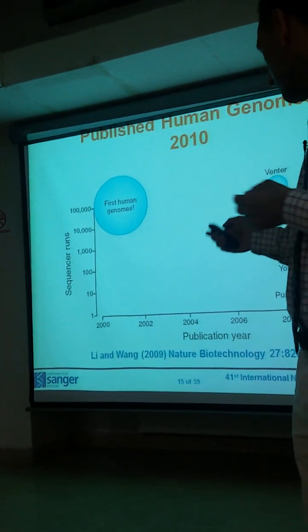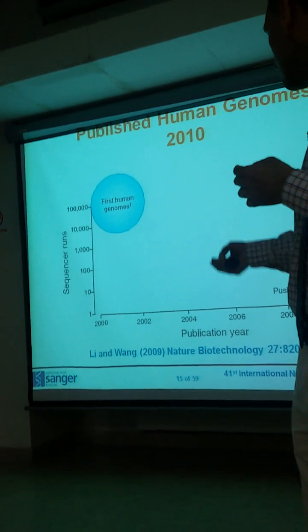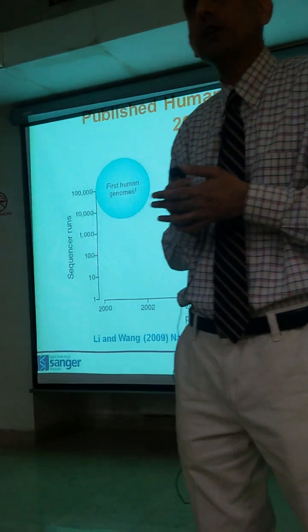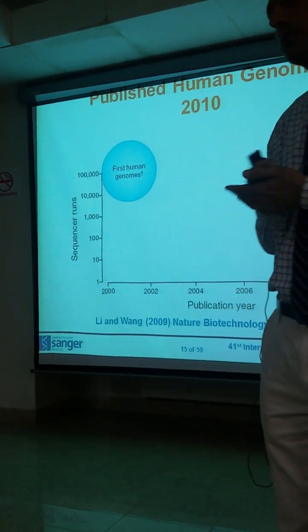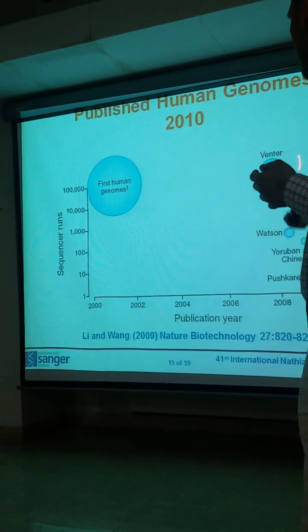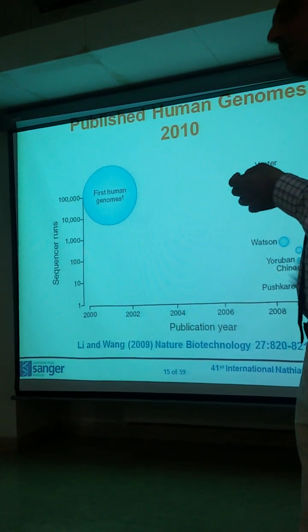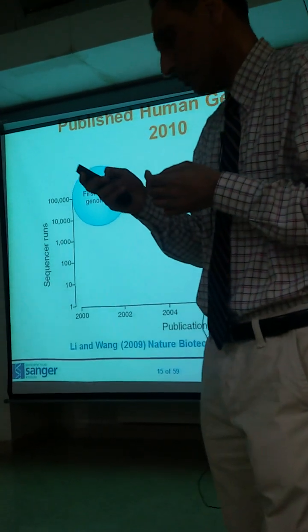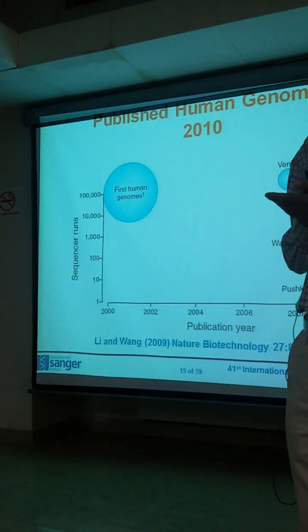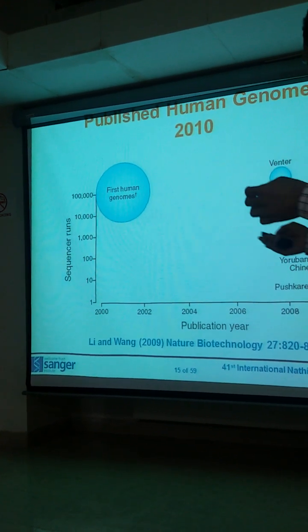And that's just describing the time and the money that was spent sequencing the first human genomes. And then, of course, one of the first next generation machines was the one which Roche developed to do further sequencing of Watson's genome. Craig Venter did his own using ABI sequencing as well. But then, since 2010, there have been thousands of human genomes, and early this year we published 2,500 human genomes, which were in the 1,000 Genomes Project.